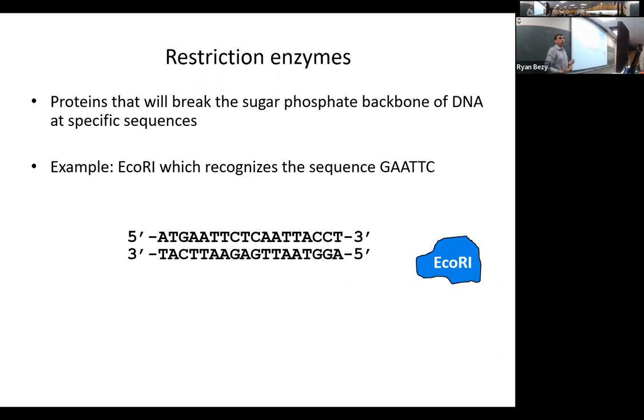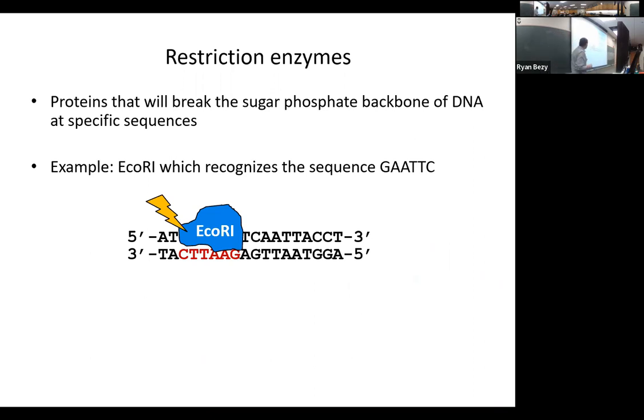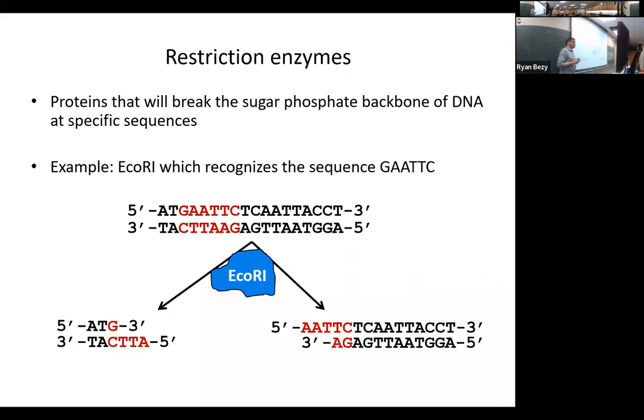It binds to the sequence of GAATTC. If you guys look in here, there it is, GAATTC. There's my little sequence in my DNA molecule here. And again, my DNA is double-stranded. So here's one of the strands held together with the other strand. That restriction enzyme, that EcoR1, will only bind to DNA at that specific sequence. So here's my EcoR1, it comes onto there. It binds to that GAATTC sequence. Once it binds to the DNA sequence, it activates and causes it to cut that DNA sequence.